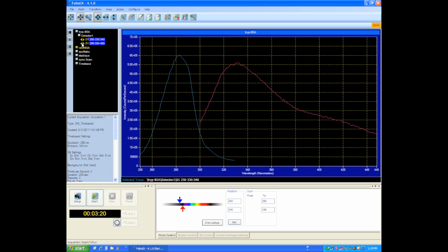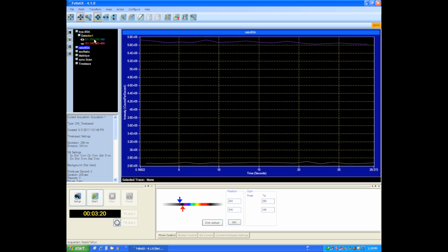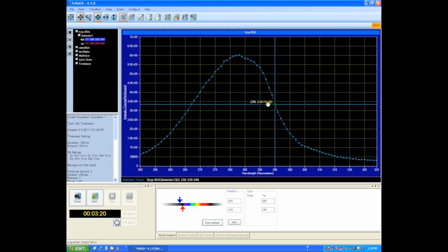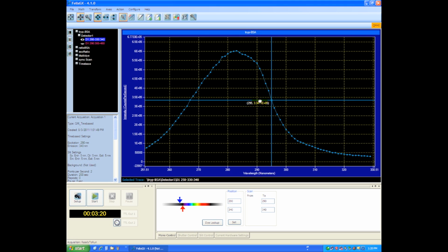Okay, we also have a data cursor. If you wanted to look at individual data points within the graph, we could just select the trace that we want, and we can enable the hide show data cursor. Now you can see here you've got the actual X, Y coordinates of each data point. This is also useful if you're going to be changing the plot mode to lines endpoints. And then I can move the tool up or down.